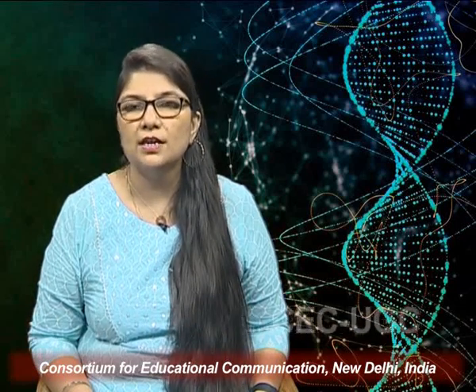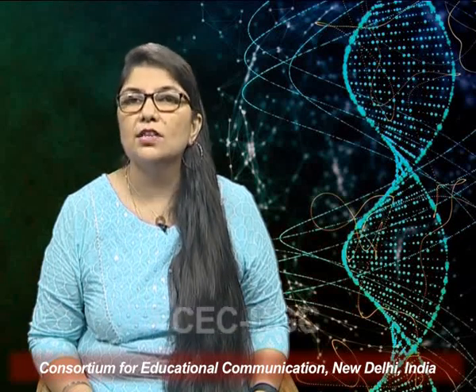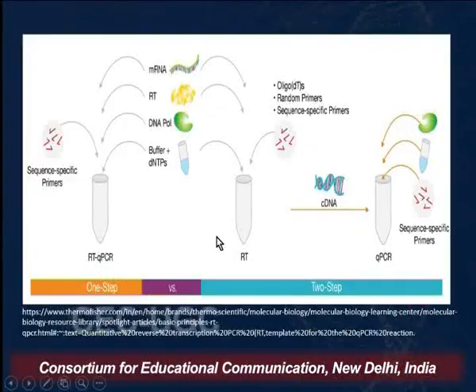So in a diseased state, you can say whether the RNA is increasing or decreasing in that state, or under different conditions whether the RNA is increasing or decreasing. You can use two methods, one is a single step method and another is a two-step method.